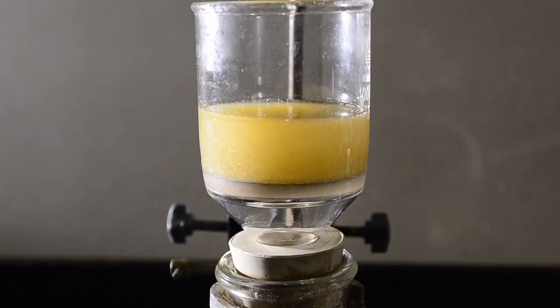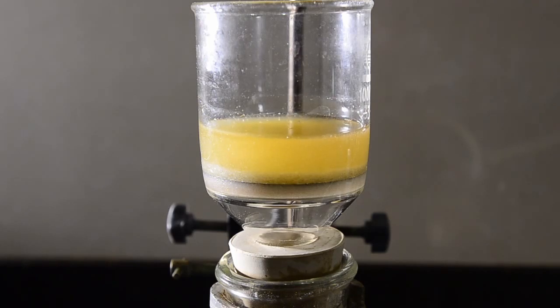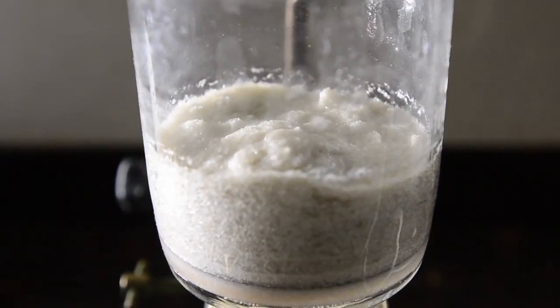Filter these and dry as much as you can again on the pump. Once again, you'll find that the crystals just don't want to get dry and have a flaky consistency, which makes it difficult to tell if they are actually dry. Remove the crystals, place in a beaker, and use a vacuum desiccator to get a completely dry product if you need it.